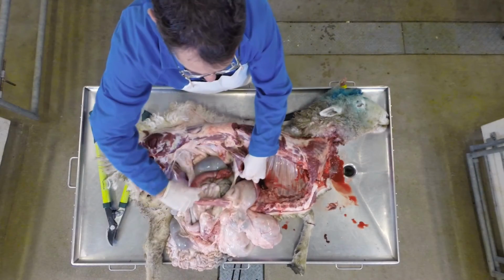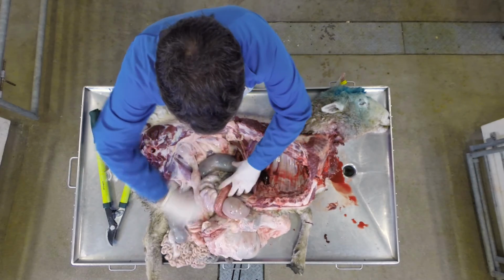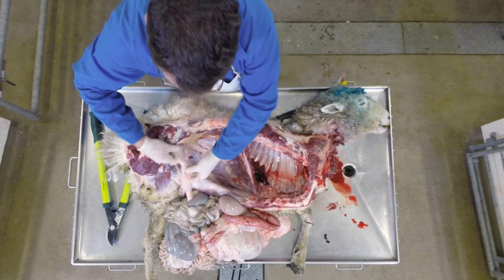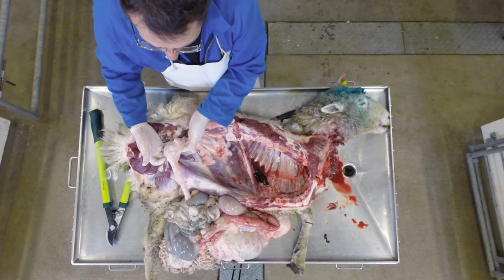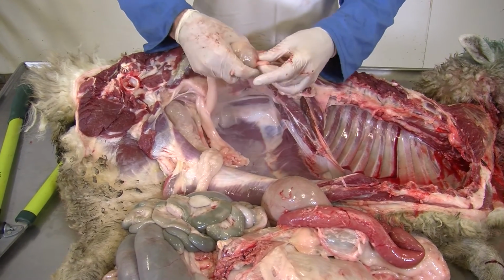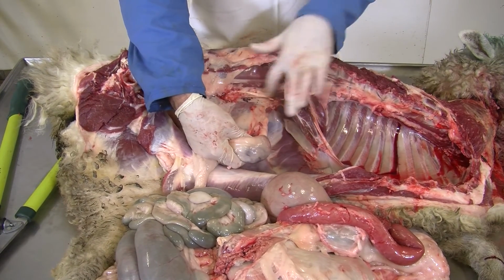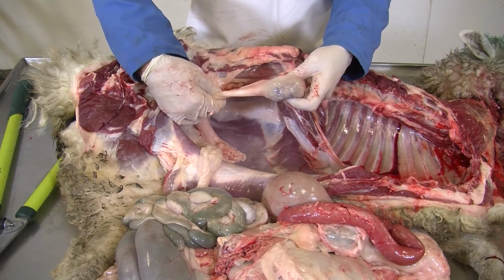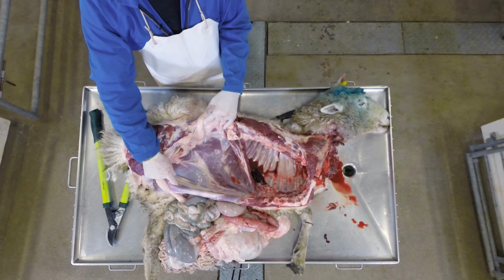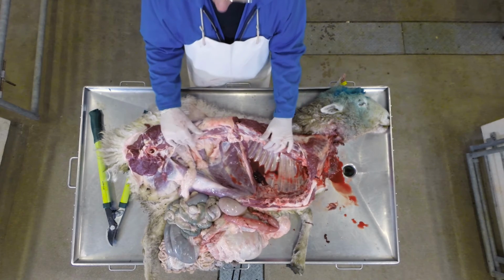Just push it out. I don't want it to go on the floor. So there's the end of the gastrointestinal tract, it's the rectum. There is here the other kidney. This one they call the floating kidney because it's a lot further away from those major blood vessels there, but still connected to them. And there you can see you've just got an empty container. So that's the organs of the abdomen.